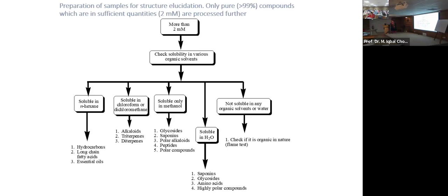With the passage of time, you want to keep the stability and homogeneity constant, and you do not want any deviation because of the constant pulse that your sample is receiving. There is a change in temperature, and change in temperature means your chemical shift will change. It's a very, very sensitive technique, in the sense that every change has an effect.